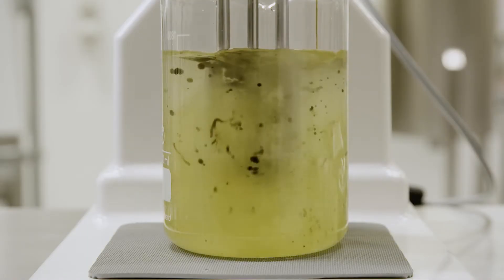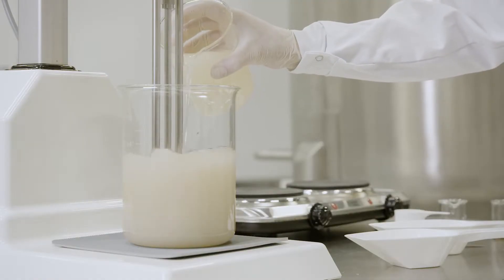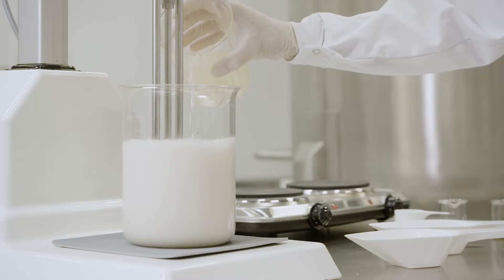With creams or lotions, obtaining a fine, uniform dispersion of the oil into the aqueous phase is the key to creating a stable, homogeneous emulsion. The intense, high-shear mixing provided by a Silverson will easily achieve this.